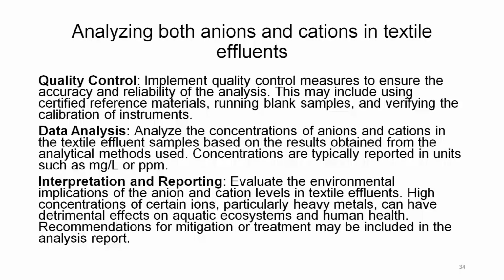Quality control. Implement quality control measures to ensure the accuracy and reliability of the analysis. This may include using certified reference material, running blank samples and verifying calibration of the instrument. And time and again we have been talking about calibration. Why is calibration so important?